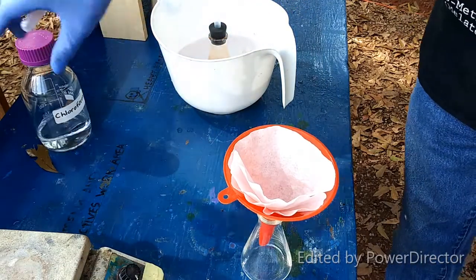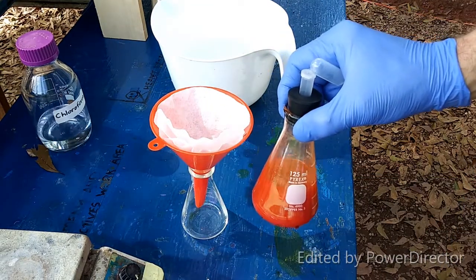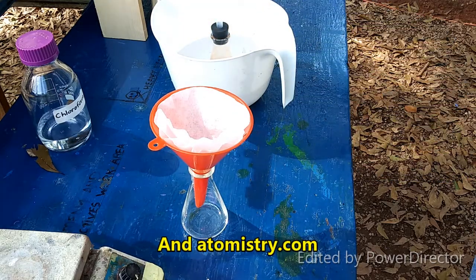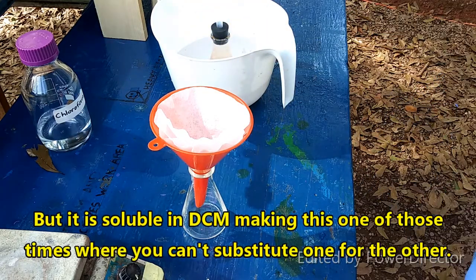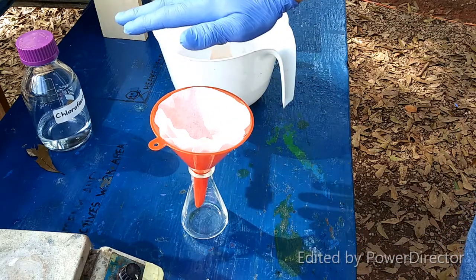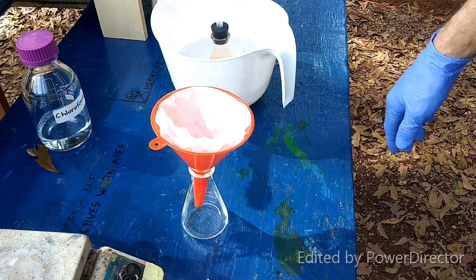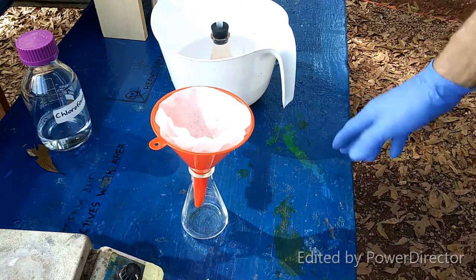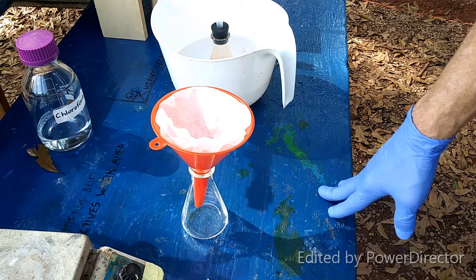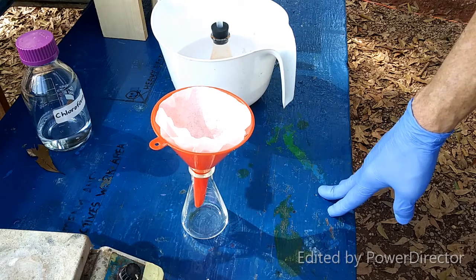Okay, my master plan here is going to be to filter off the antimony triiodide crystals that we've got. And then, according to Wikipedia, the antimony triiodide is not soluble in chloroform. So once the crystals are filtered off, I'm going to rinse them in chloroform and then try to dry them with hot air as quickly as possible. Chloroform will evaporate far more readily than toluene, so maybe I can dry them out this way without having to use vacuum. It's a bit of a long shot, but I'm going to give it a try.